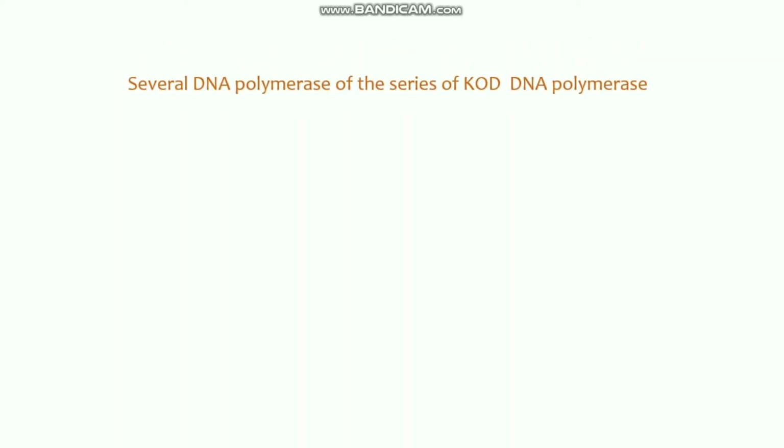So next is the several DNA polymerases of the KOD DNA polymerase series. I'll talk here about the KOD DNA polymerases that are available in the market. Different manufacturers modify this KOD DNA polymerase and produce different kinds of products. These products are all of the KOD DNA polymerase series, but their features are a little bit different from one to another.